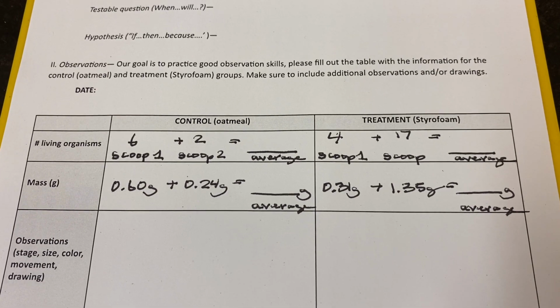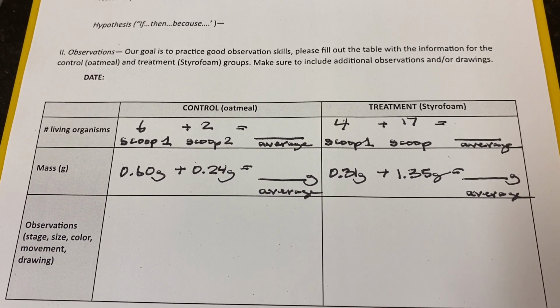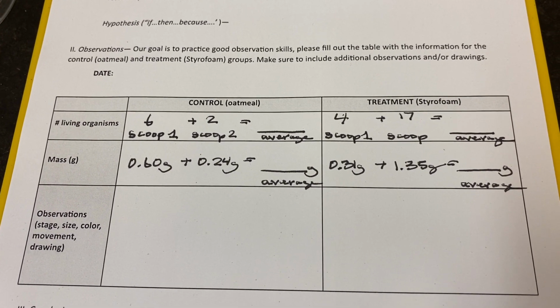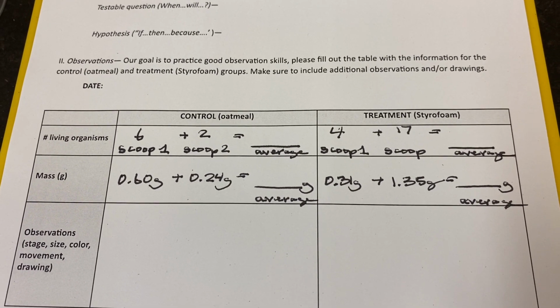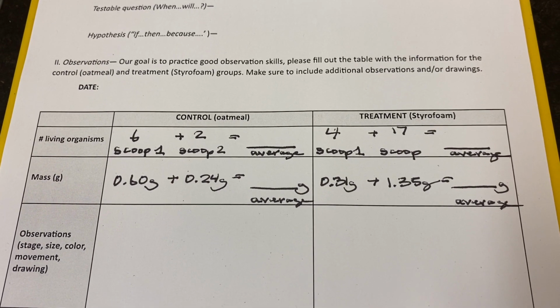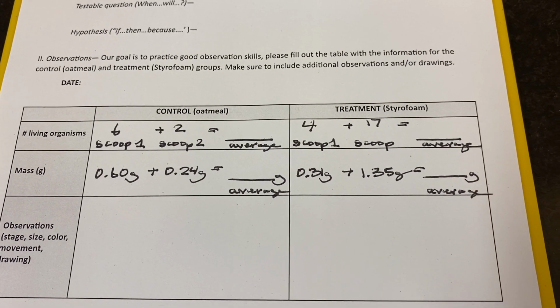Below the line for the number of living organisms is mass. So scoop number 1, the mealworms weighed 0.60 grams. The mealworms from scoop number 2 weighed 0.24 grams. You're going to need to determine the average mass of an individual mealworm by adding up those 2 numbers, dividing by 2, and I'll give you the average.